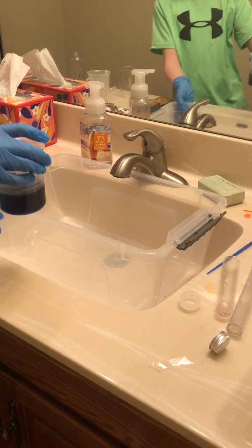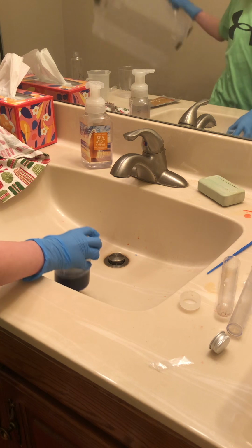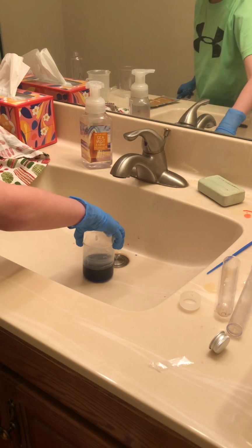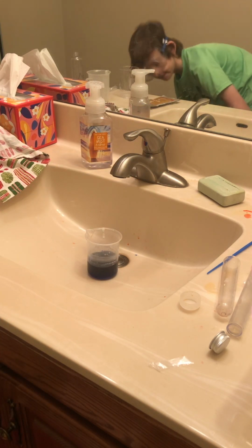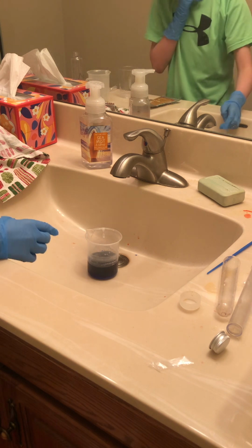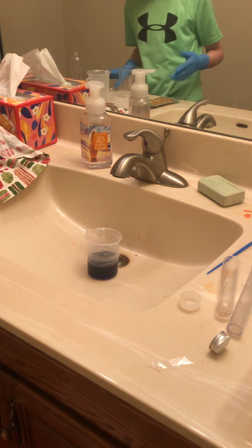First, I'm gonna take this, and actually, we don't even need that. However, I'm going to lock the drain, because I do want to take the byproducts of this, so I can use it for later experiments. We're gonna take out the bin, and we've got this. Can you guys see that? Yeah, you can. Okay, good. That's the baking soda solution, just baking soda plus water that's stirred around.